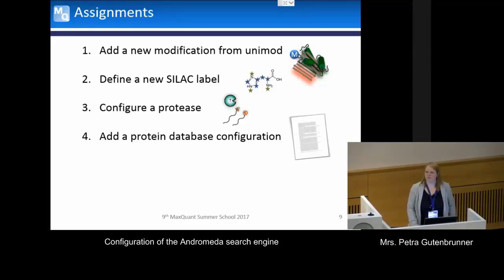Is that contaminants file automatically added, or do we need to go through this process that we just did with that contaminants file? No. This is done every time when you start the search. This is automatically added. Okay, and if you wanted to add additional contaminants, you'd add it to that text file that you just showed? Yes. And it would automatically be used by MaxQuant? Exactly. Okay, thank you.